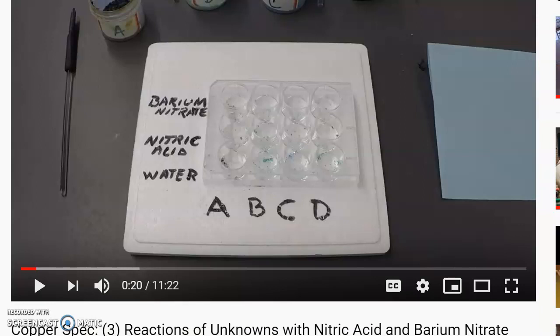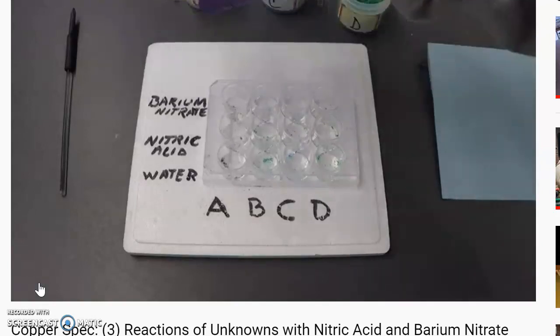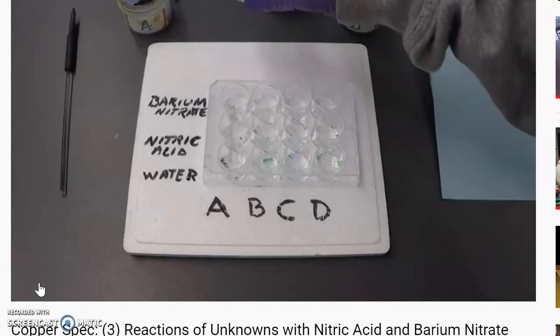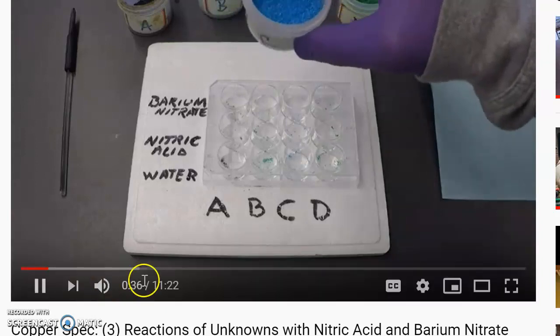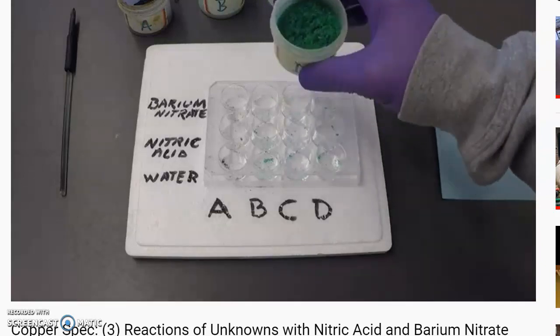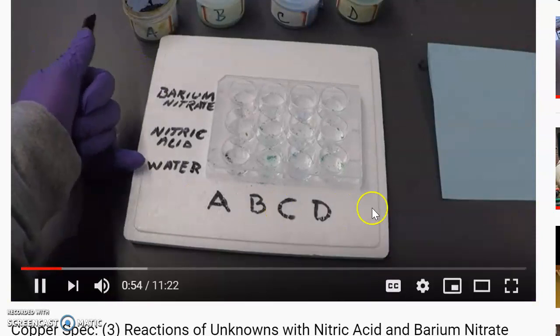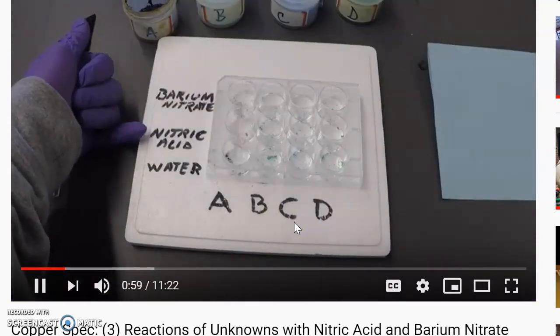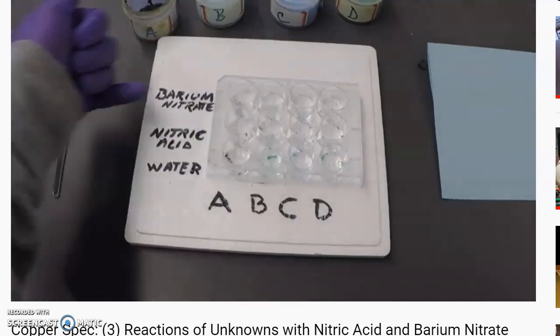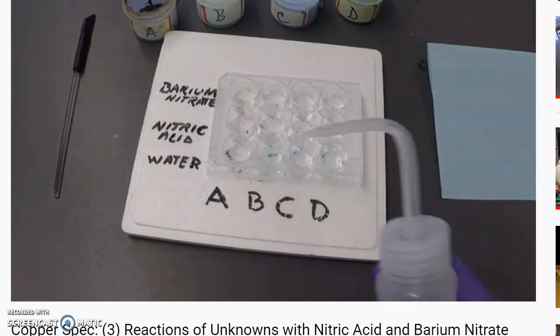All right, so here's part 2. We are doing our reactions with water, nitric acid, and barium nitrate. And this first part is really just kind of looking at these samples. You can make observations, and the way this is set up, we have a well plate here, so we can do small reactions, qualitative reactions. We're not measuring the amounts of any of these things, but we have A, B, C, and D in all of these well spots, and going across, we're going to react them with the different items.